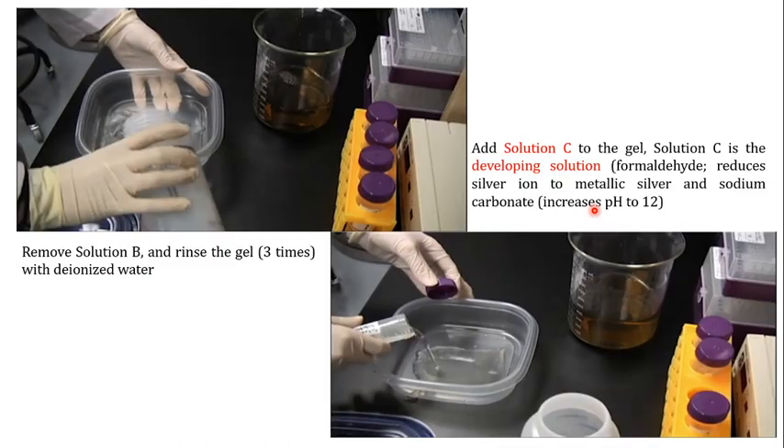Once you have incubated the gel with Solution B, remove it and rinse the gel three times with deionized water to completely remove Solution B. Next, add Solution C to the gel. Solution C is the development solution. As previously explained, the developing solution contains formaldehyde, which reduces silver ions to metallic silver, and sodium carbonate, which increases the pH to approximately 12. So Solution C — the developing solution — is added.